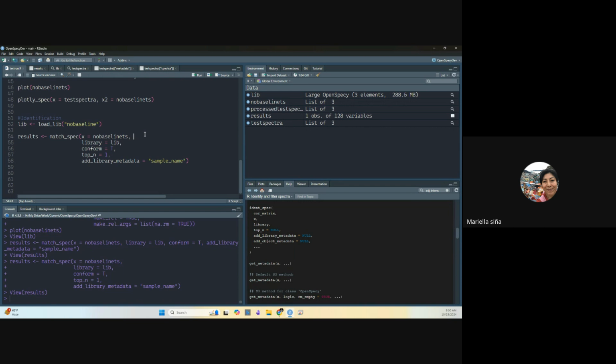Honestly, I had spectra of the same particle, some of them, not all of them. Some of them I had the same particle three times. I pointed to the same particle, so I don't know if that caused them all to look the same or something like that.